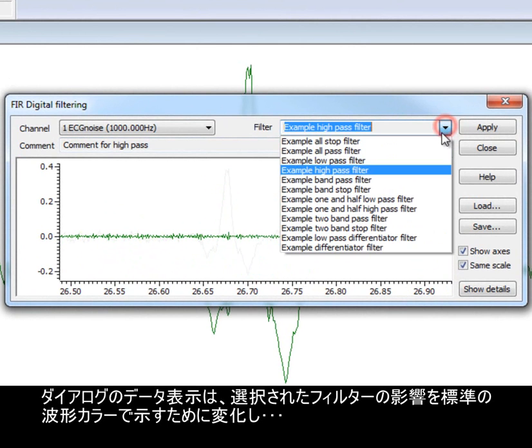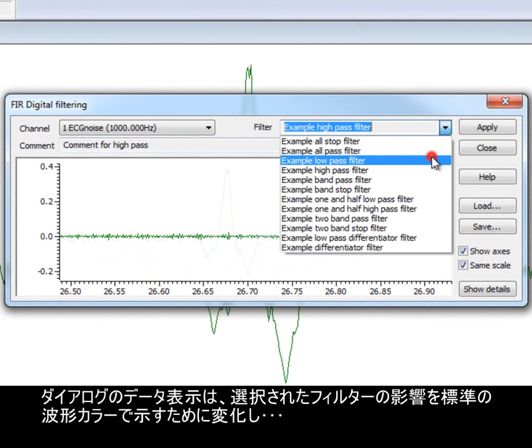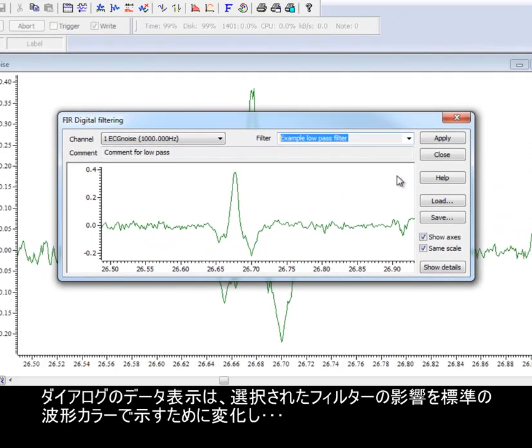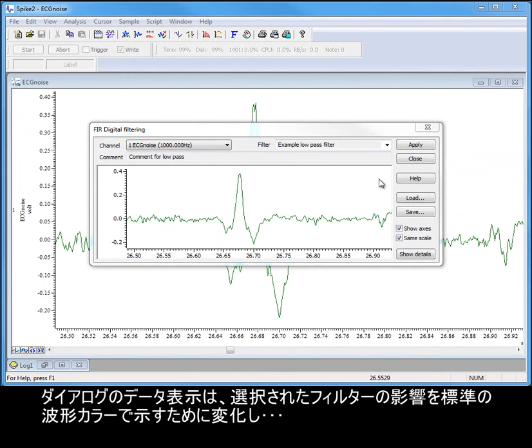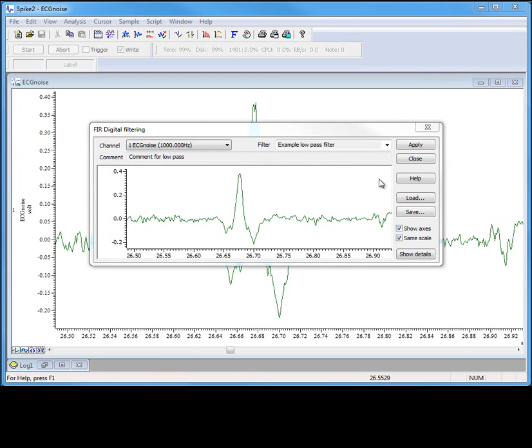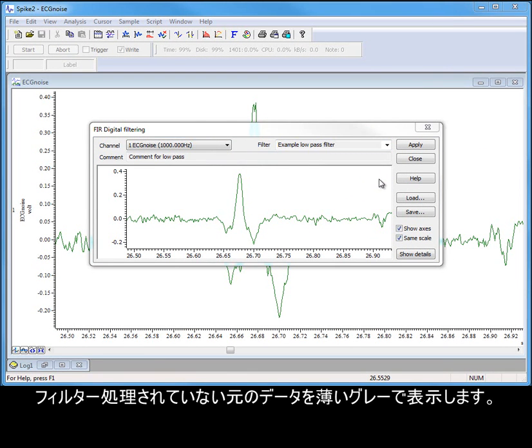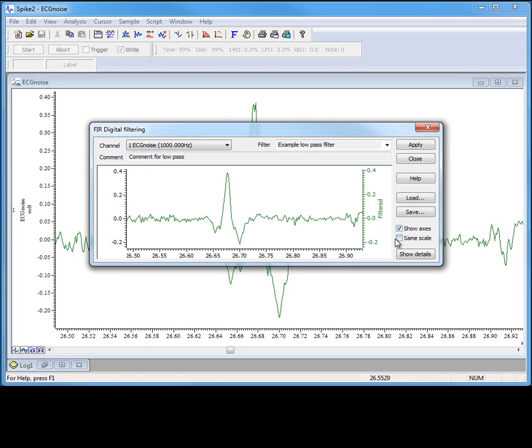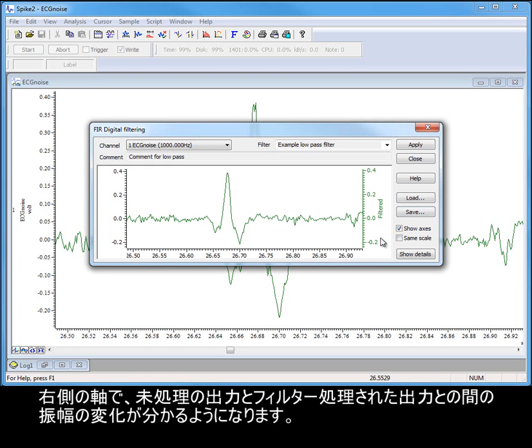The data display in the dialogue changes to show the effects of the selected filter in the standard waveform colour, with the original unfiltered data shown in grey. If we uncheck the same scale option, the filtered data is scaled to fit the display window, and we will be able to see the changes in amplitude between the raw and filtered output on the right-hand axes.